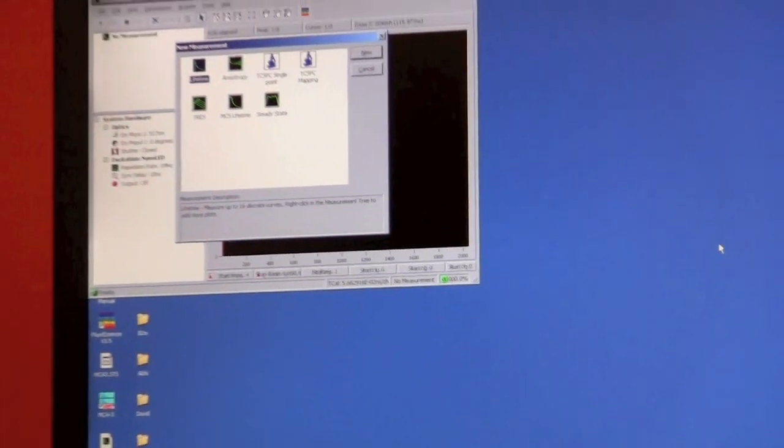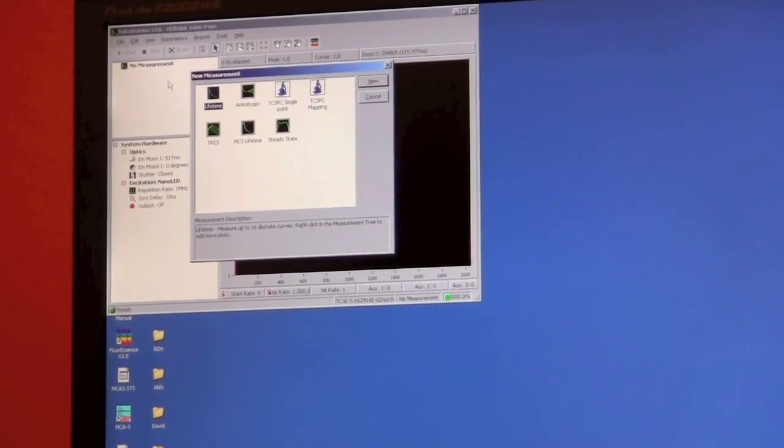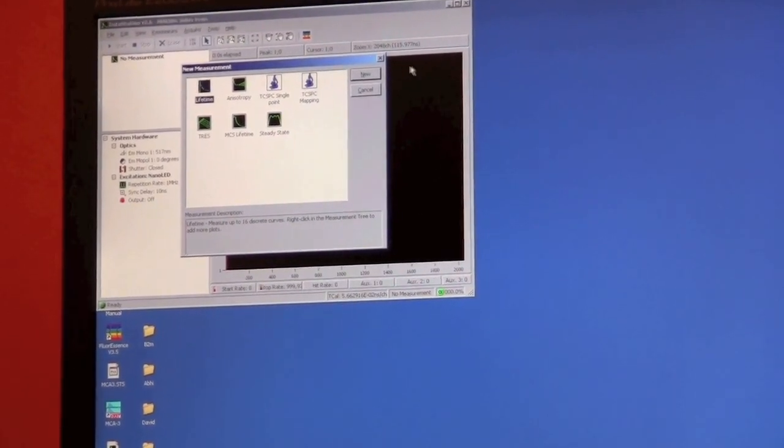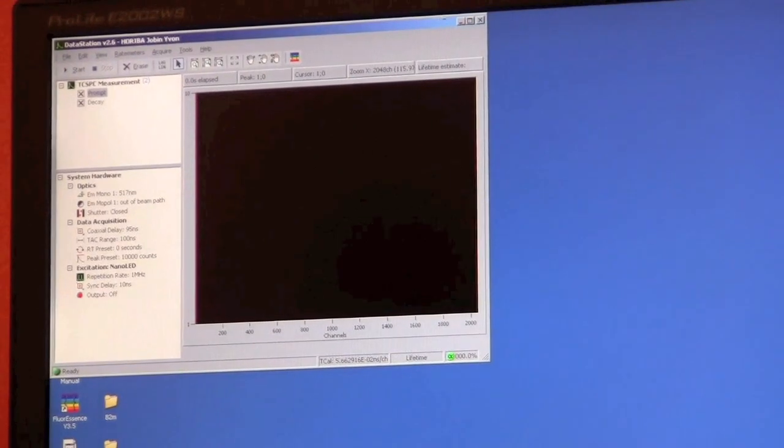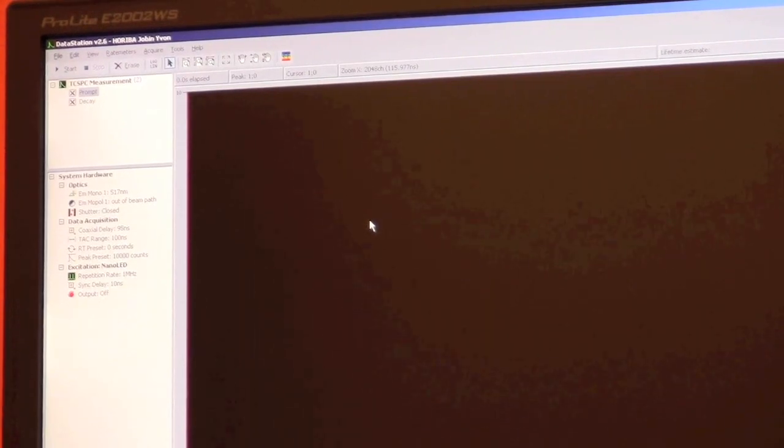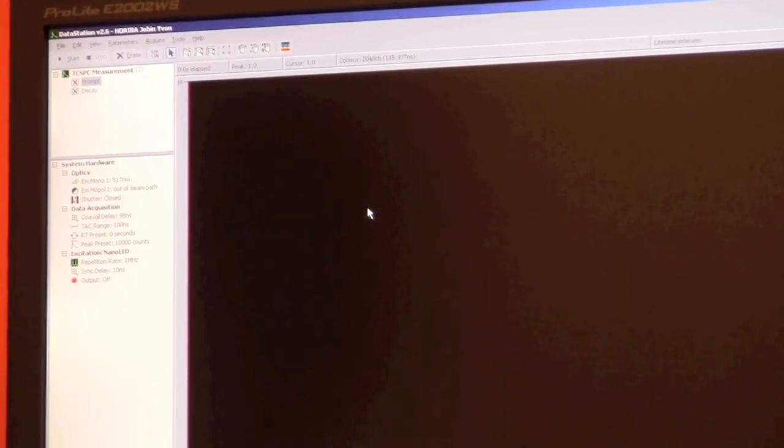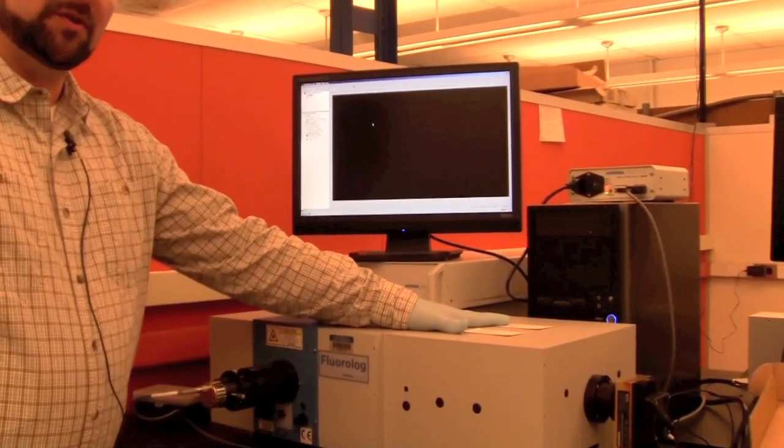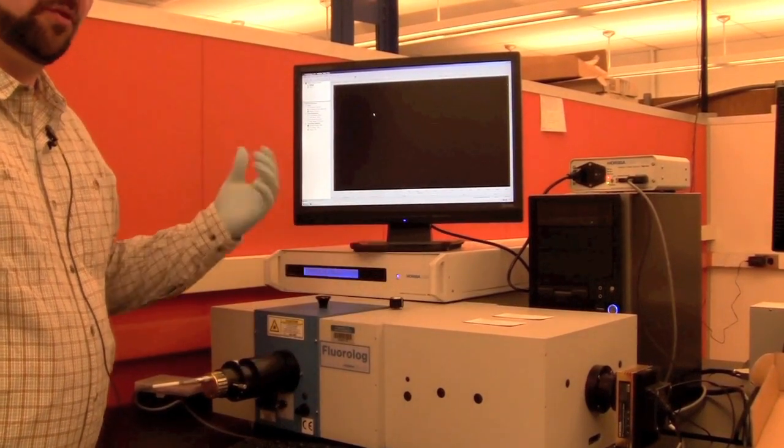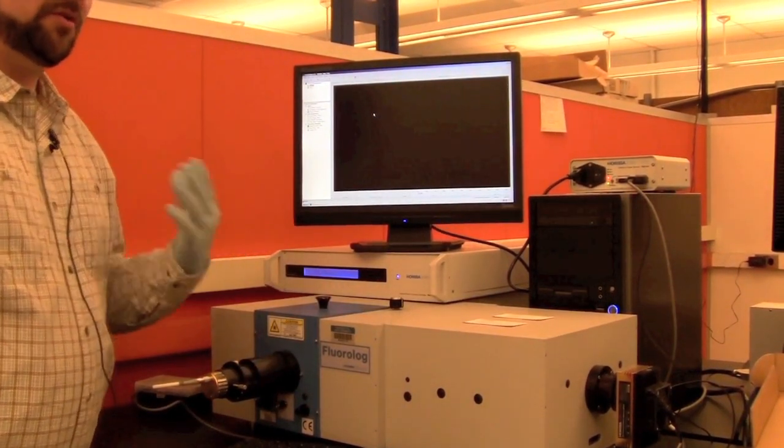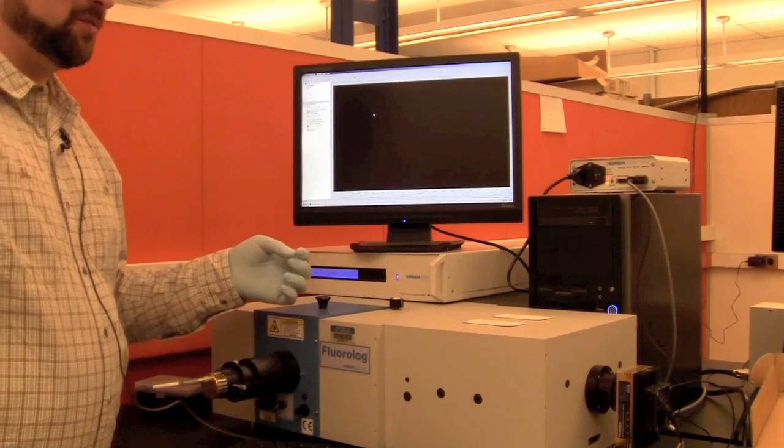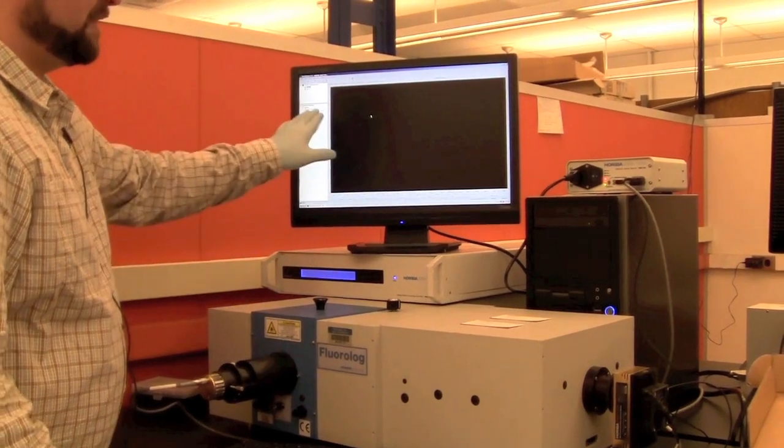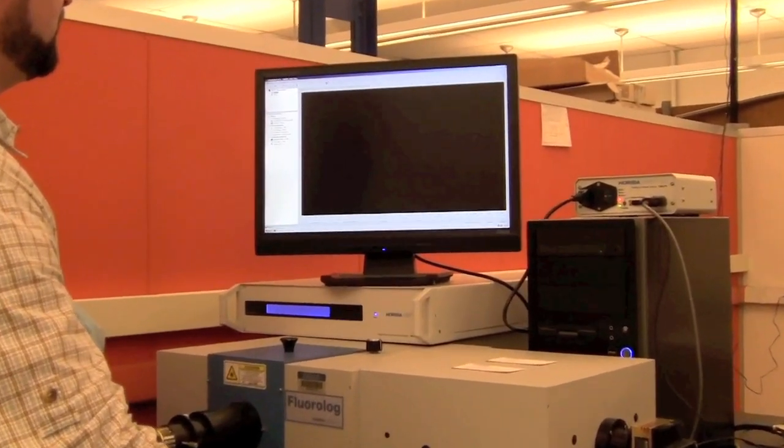We want to do lifetimes, so we'll click on lifetime here. First, we want to make sure we have our emission monochromator at the wavelength to record the emission for whatever fluorophore we're using. Since we're using 488, we want to record its peak emission, which is 517. I've already set the emission monochromator to 517.